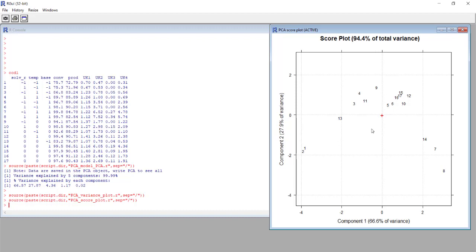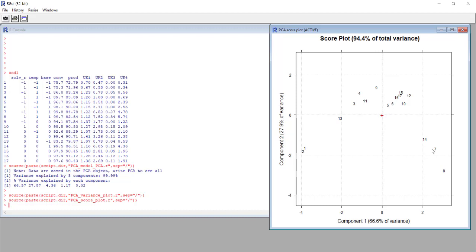For example, one of the observations that we can make is related to the points 15, 16, and 17 that are the replicated central point. Here we see that the experimental variability for the three points that are replicates under the same conditions is really small if compared to the experimental variability of all the experiments of the experimental design.